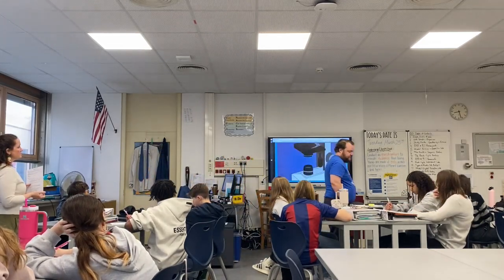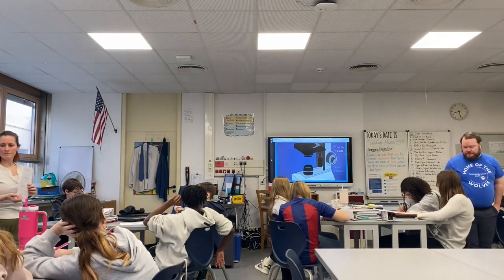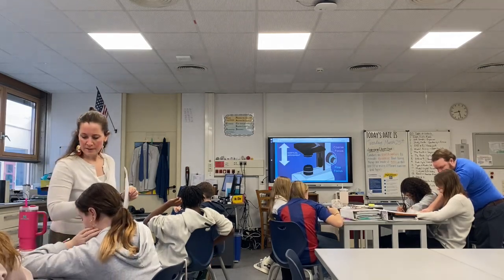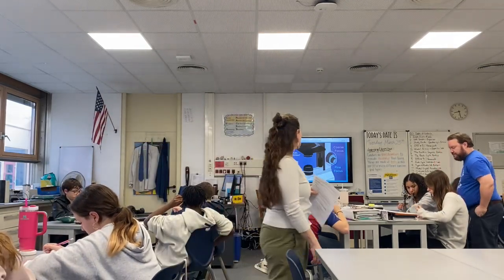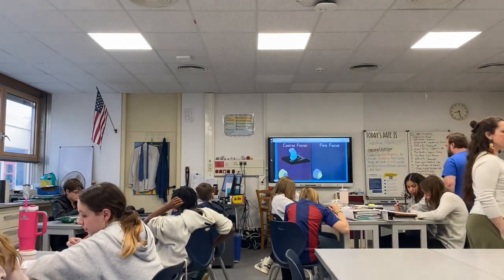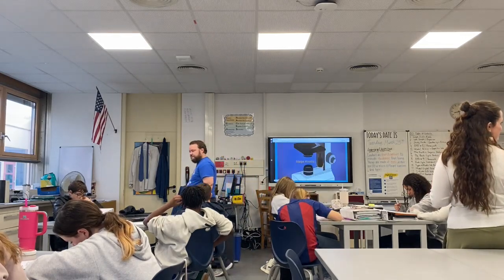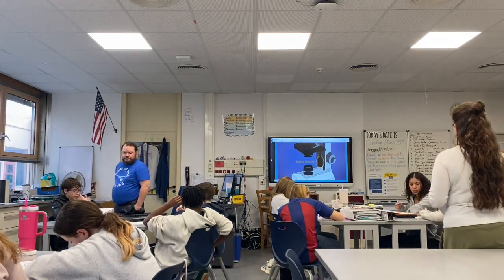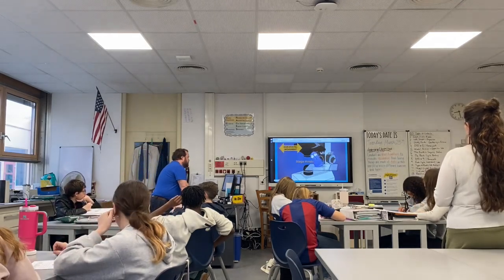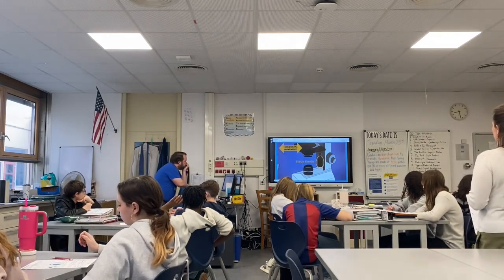Now you'll also notice there's a lot of knobs here. Let me introduce you to the knobs. This large knob here is known as the coarse focus, and then this smaller knob here is known as the fine focus. Both of these knobs raise or lower the stage, which helps with focusing. The coarse focus knob will move it more dramatically, whereas the fine focus knob will move it in smaller increments. These knobs, the stage knobs, don't move the stage up and down, but rather from side to side instead. It helps you explore what's on the slide itself, but it isn't adjusting the focus of it.